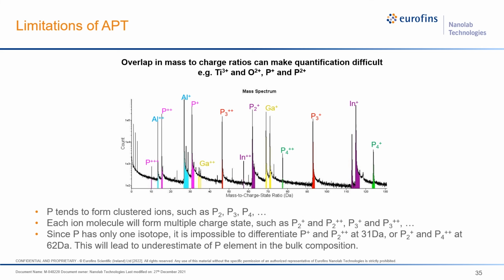The first is to look at the isotopic presence and abundance. Atom probe tomography can actually identify individual isotopes. So you can look at whether a single peak has the isotopes present around it, not only the presence, but also whether they are abundant in the correct ratios, because for a naturally occurring element, you should see signatures of all of the isotopes. And you can use that to identify whether it's one element versus the other.